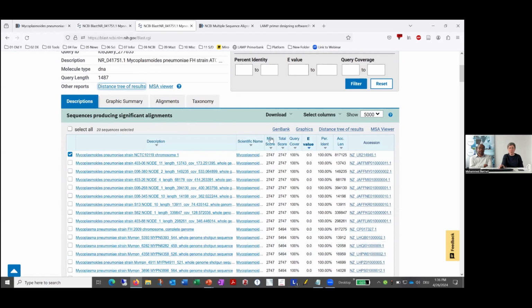We have a table with many data. And you can see here that in total we have 288 sequences as hits. And of all the data, only 3 columns are of interest to us. This is here, which gives information about how much of the query sequence is covered by the hit. So if it's 100%, the hit covers the whole length of the query.